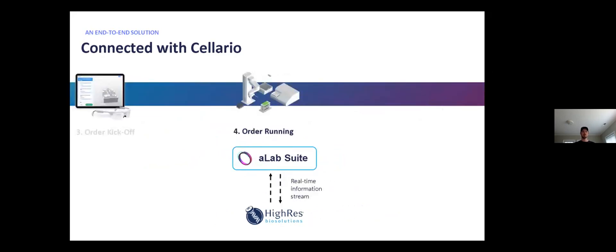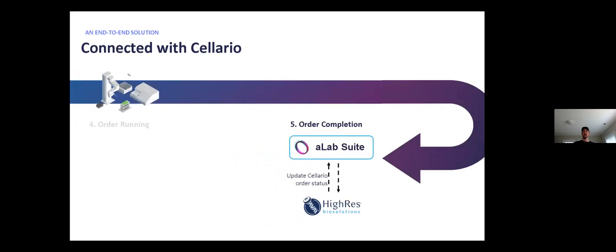Once the order is running, A-Lab monitors the data stream and passes along the relevant information and events back up to the user in A-Lab. So this is where we can see things like plates moving or the actual status of equipment.